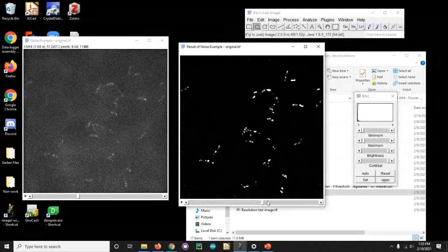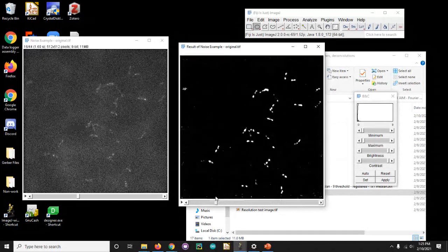Okay, so one thing we could do at this point is, you see we have a little bit of a registration issue, but to save time, I'll not do the registration. Actually, I can do it. You can see that our sample is drifting a little bit at the start. You can tell that by the whole global frame drifting. And there is no way we could ever register this original image because there's just too much background signal. It's going to try and register that. But now we have a chance.